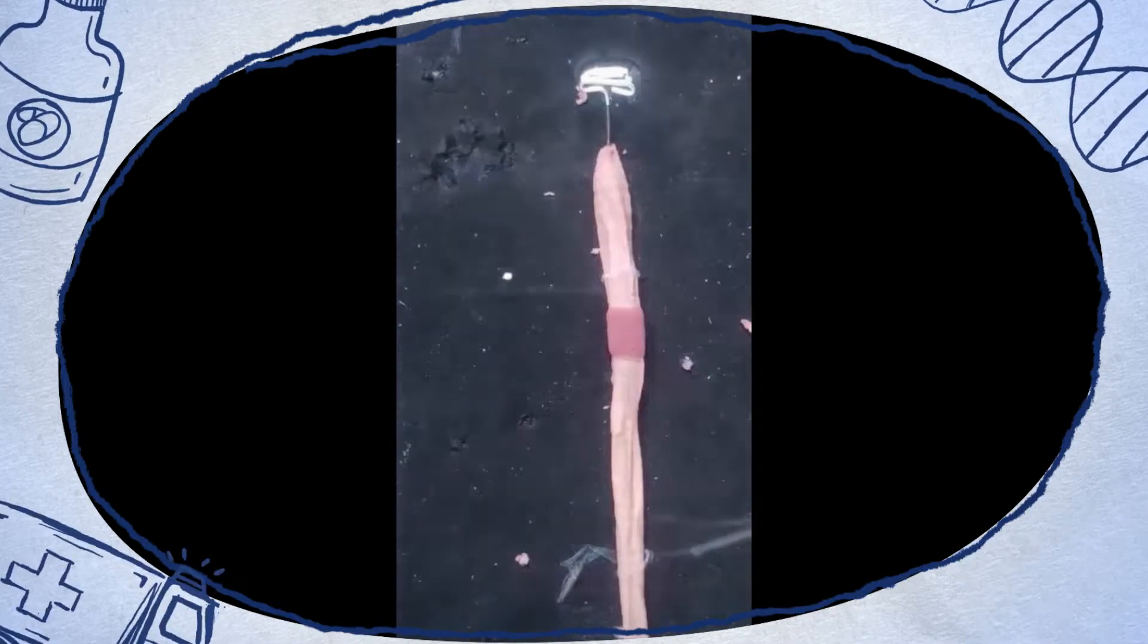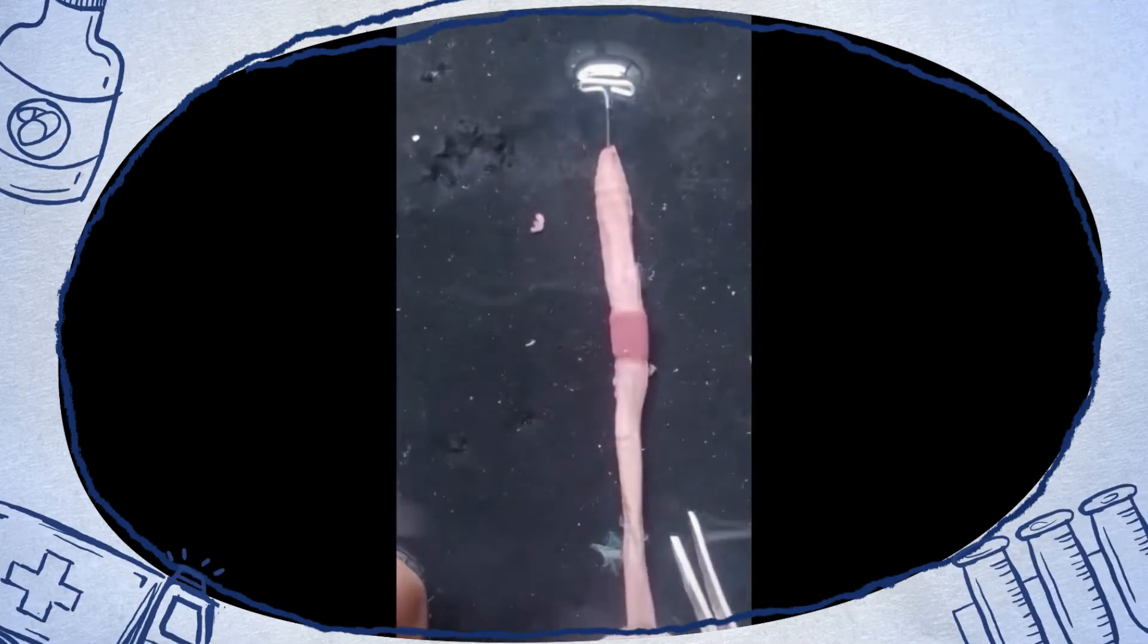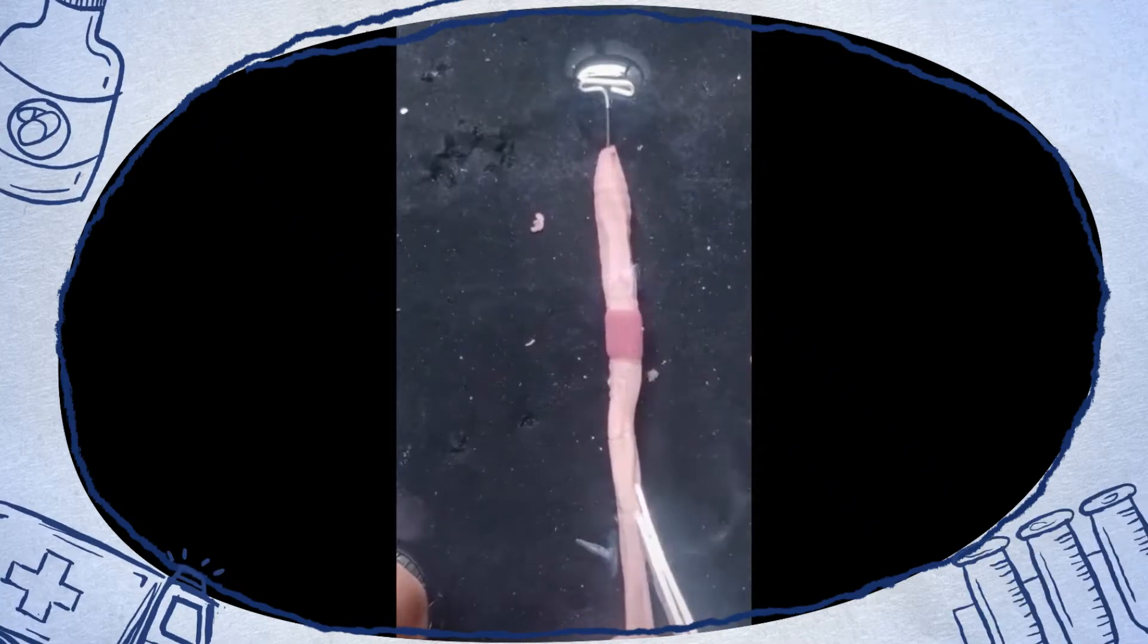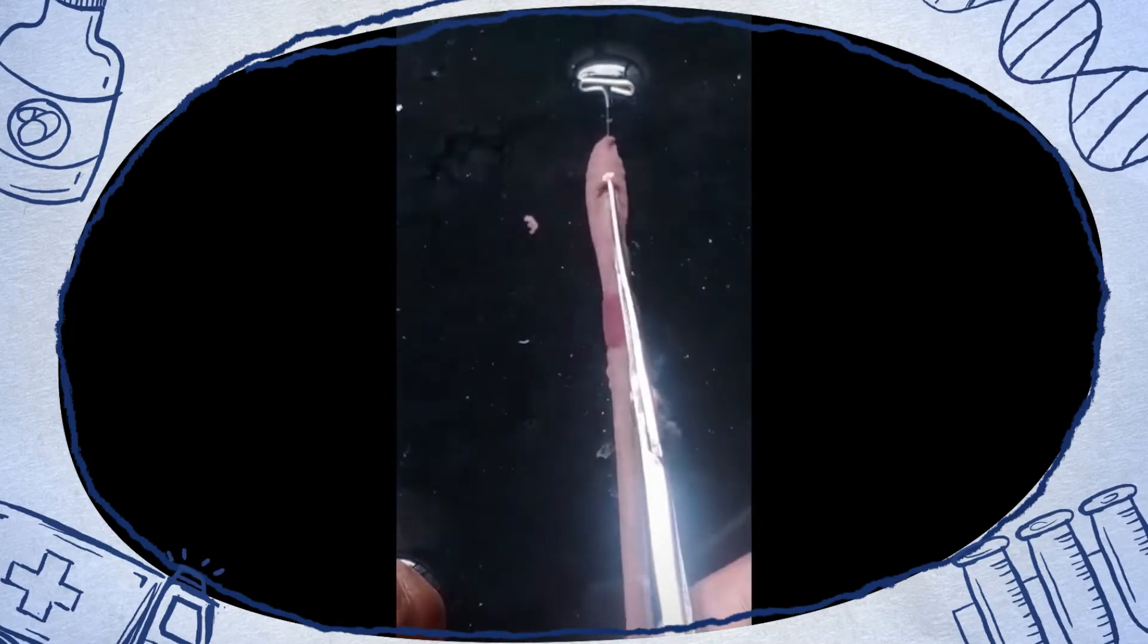To begin with, pin up the animal with its dorsal side up. To check for the dorsal side, look for the dorsal blood vessel. Then make a small incision on the dorsal side and cut open the animal.